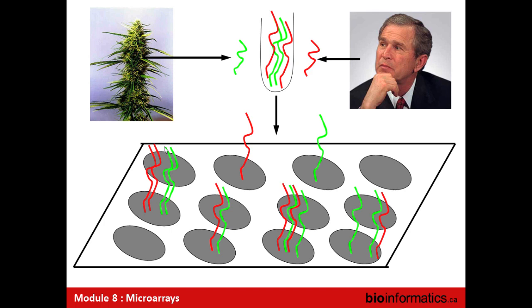So the probe itself is single-stranded DNA, so it doesn't do that. So that's one comment. The second is that these are generally done at reasonably elevated temperatures. The number's not in my head, but I think the hybridization is 60 degrees or maybe it's 70 degrees. That's enough to make sure that no secondary structure should be forming in RNA.